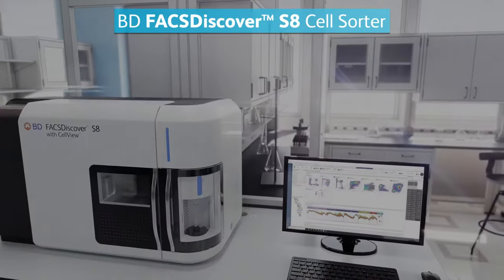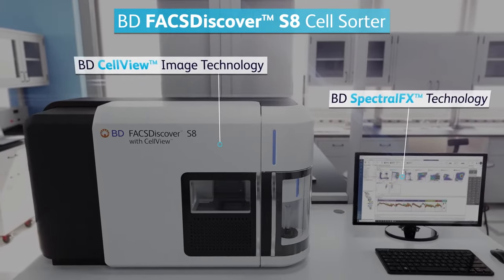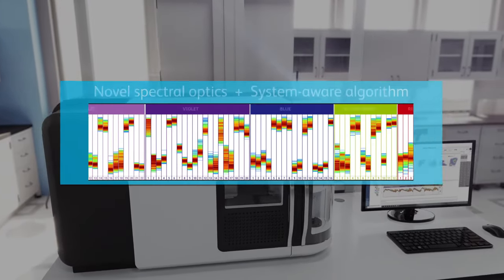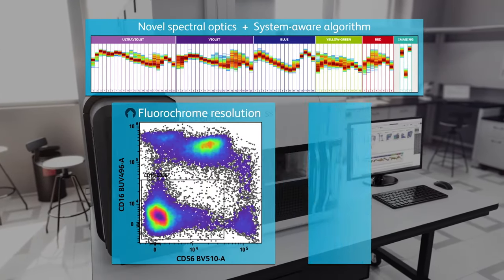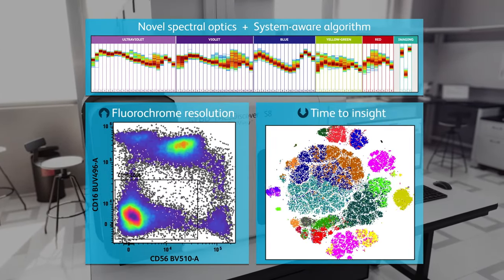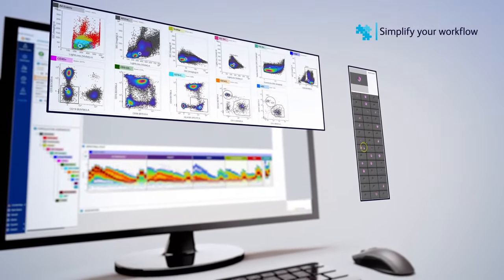BD FACSDiscover S8 Cell Sorter with BD CellView Image Technology and BD Spectral FX Technology combine novel spectral optics with a system-aware algorithm to increase fluorochrome resolution and reduce time to insight. Simplify your workflow with built-in visual inspection and automated features.